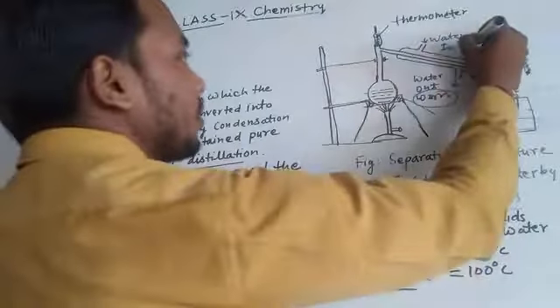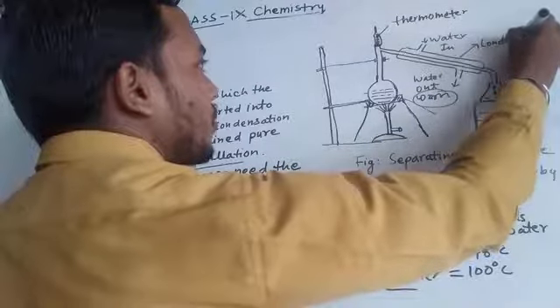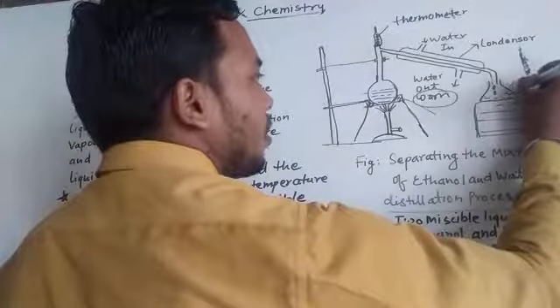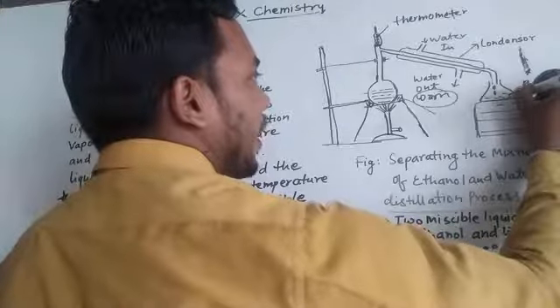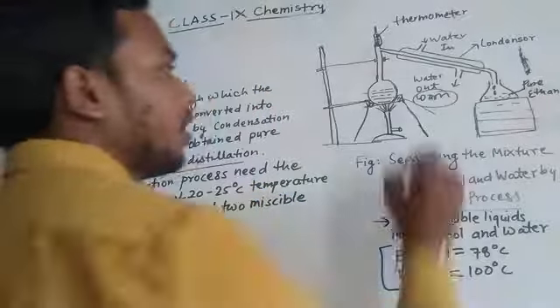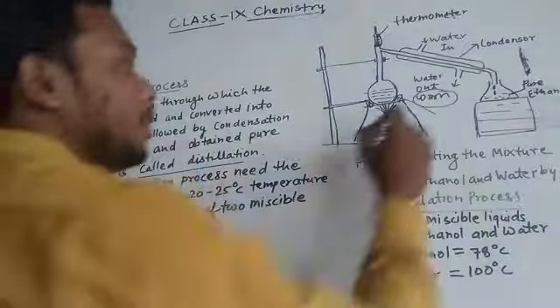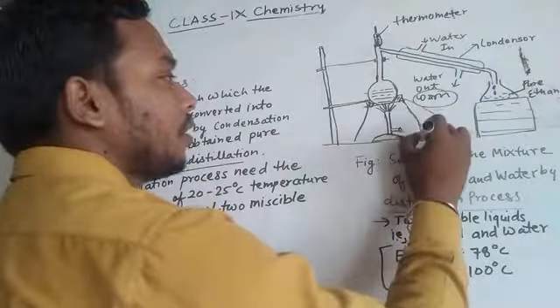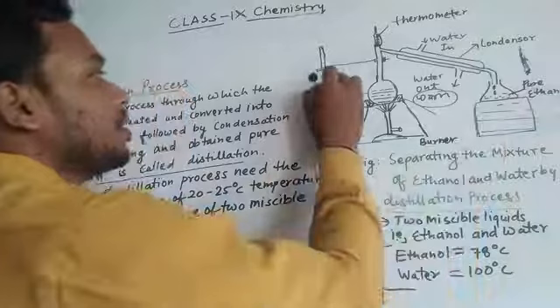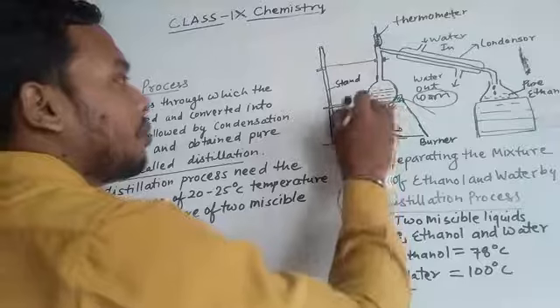Here is the pure liquid, pure ethanol, and it is a burner, and it is a tripod stand.